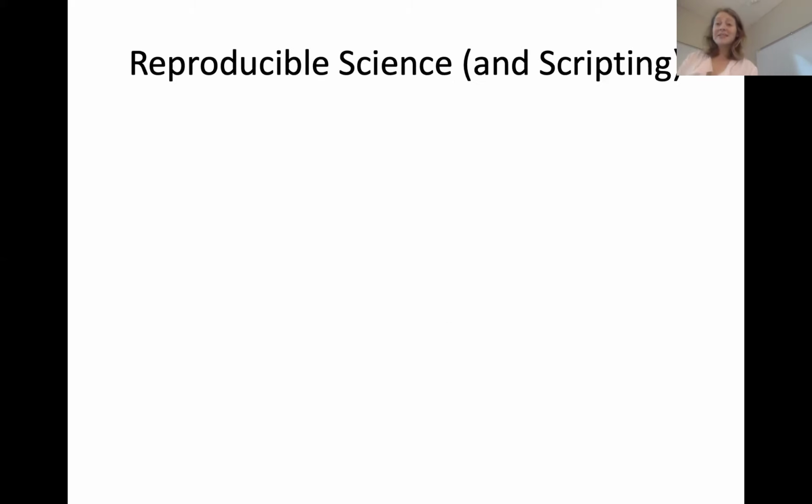So that's pretty much all I'm going to say about counting until we do the lab. So any other questions about read counting? Fortunately, that script makes it really easy. So for the non-unique, that means not including multi-copy genes, some genomes have multiple copies. Yes, so that is a huge problem. If that's your primary biological interest, are these genes, like one of my students, she has 6 tandemly duplicated genes, and there are regions that are definitely the same amongst them, and you can't map the reads uniquely.